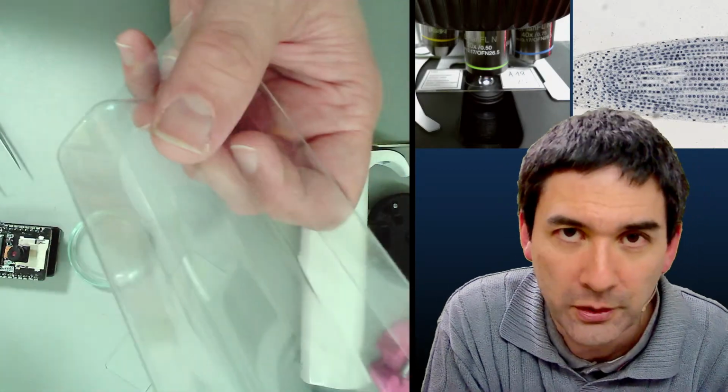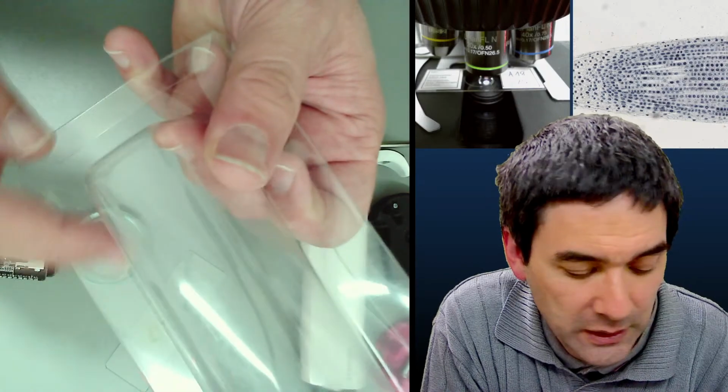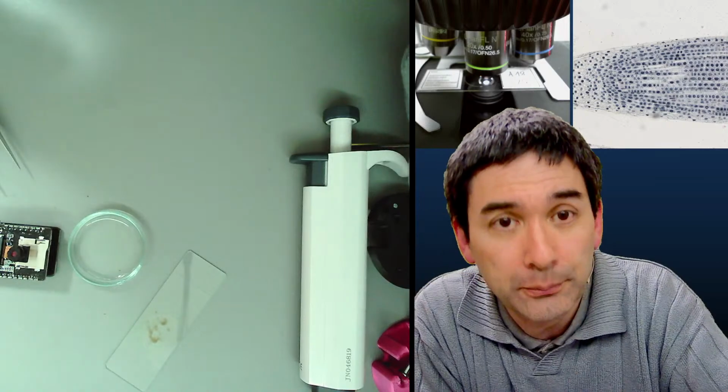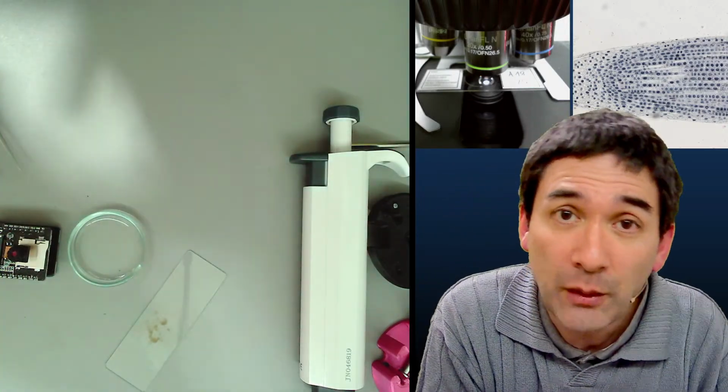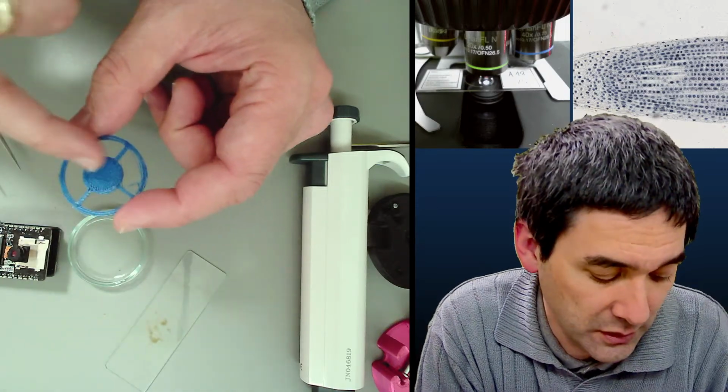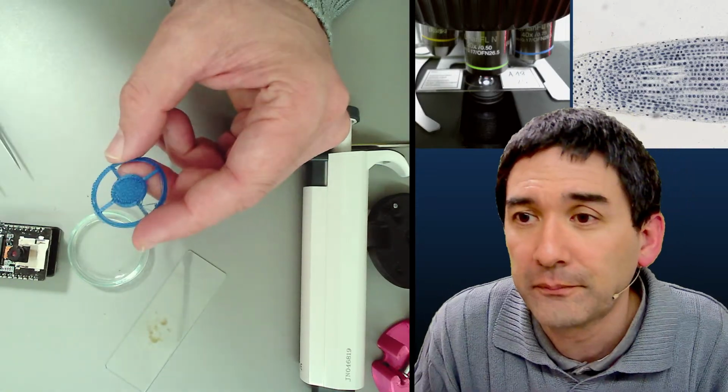I always use blue because of the nice background color, and then you can also try to paint something. Or if you have a color printer, you can try to print something. However, I found out that color printers usually do not give a dark enough result. So this has to be fairly dark, okay.